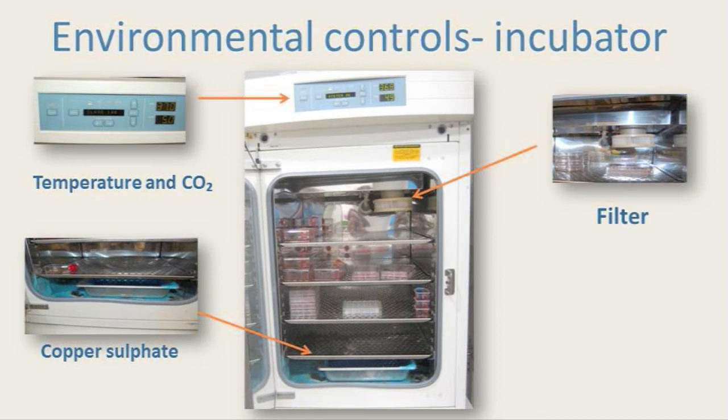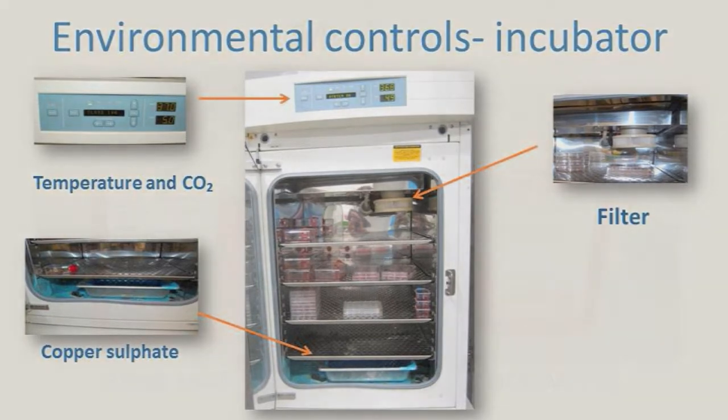Filtered air is recirculated through the incubator to minimise contamination. Copper sulfate crystals can be used at the bottom of the chamber and are responsible for preventing mould which may form due to the high humidity.